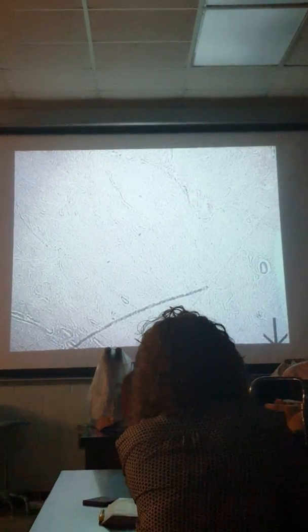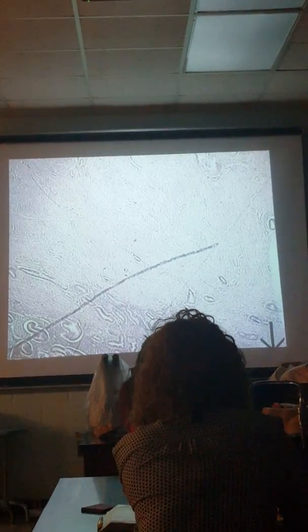So this is secretory phase or progravid phase. You get two perspectives in the naming schemes. If you're an ovary or a uterus, what's happening in each one gives it a different name. So yeah, look at those really large, well-developed uterine glands.